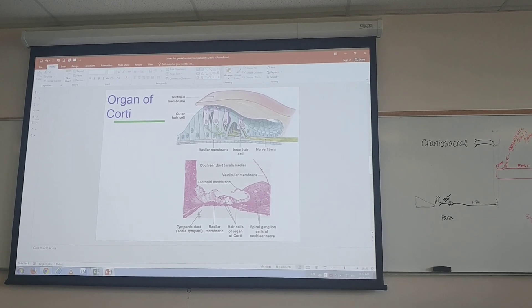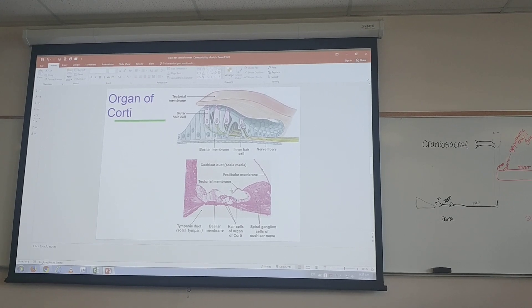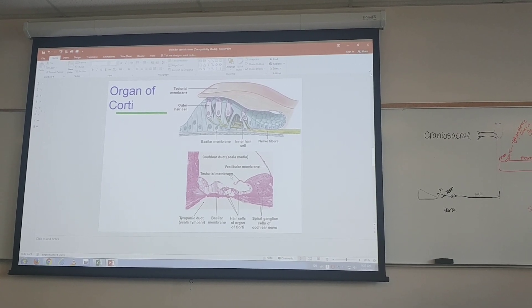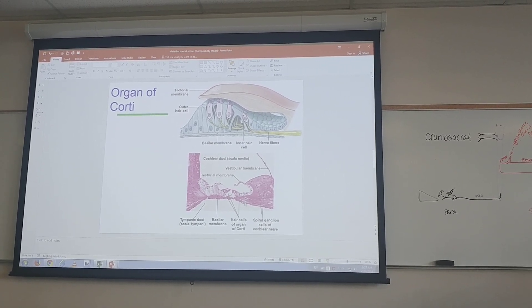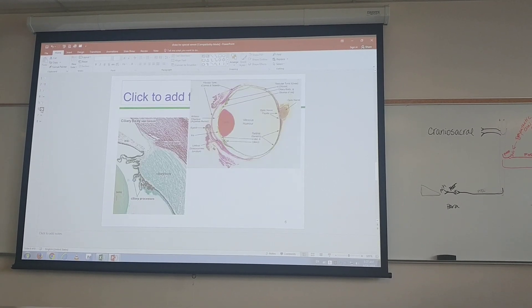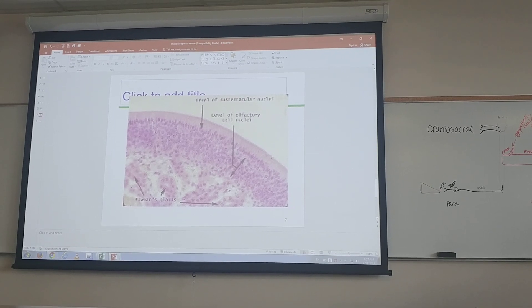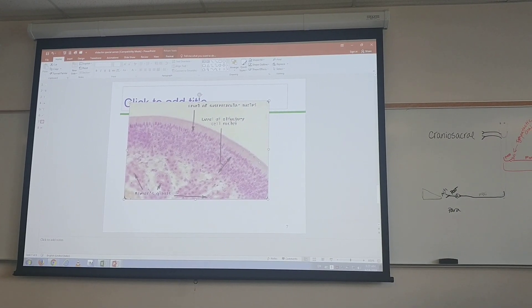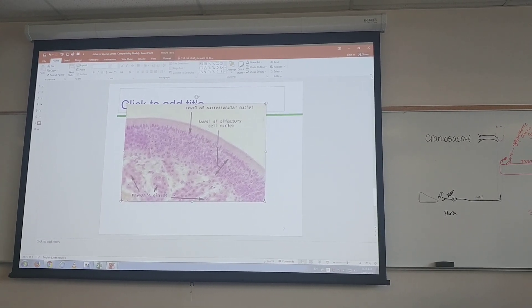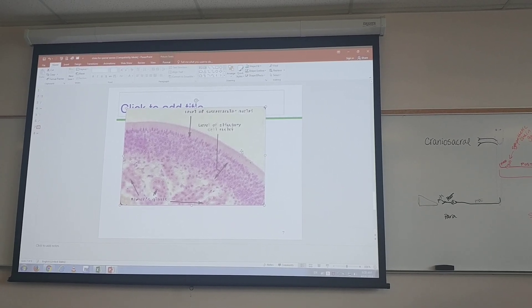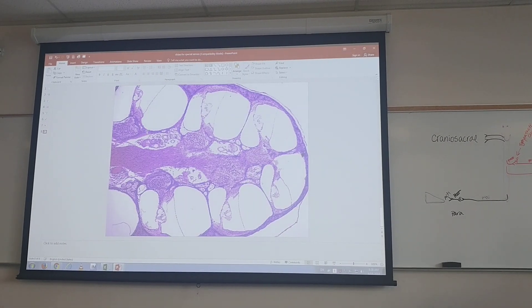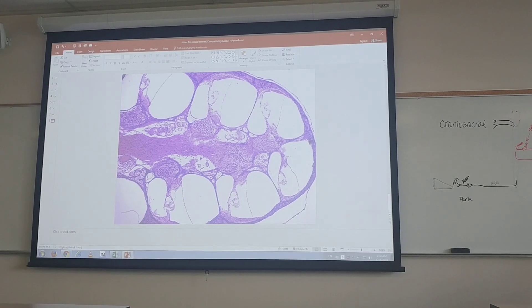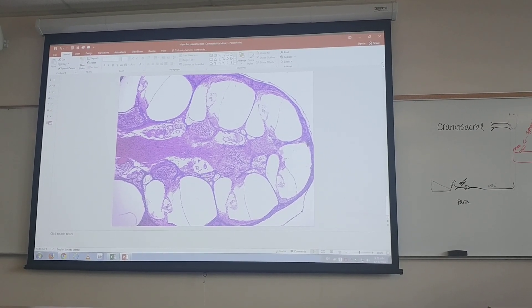Back to the ear — here's another spiral organ. There's your tectorial membrane, and this is the vestibular membrane. Seeing both of these means I'm in the cochlear duct, which is filled with endolymph. The little hair cells will be down below. This is not a great slide of olfactory epithelium, but it has PCCE — there's the shag at the top, the microvilli of the receptor cells. And finally, the cross-sections: being able to name those ducts in the cochlea — the vestibular duct, cochlear duct, and tympanic duct.